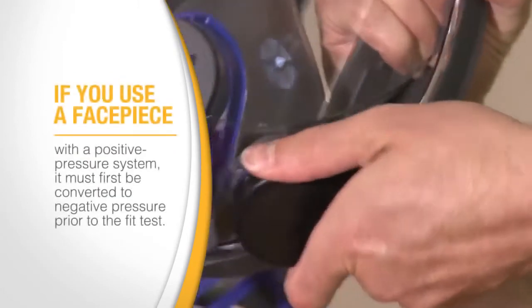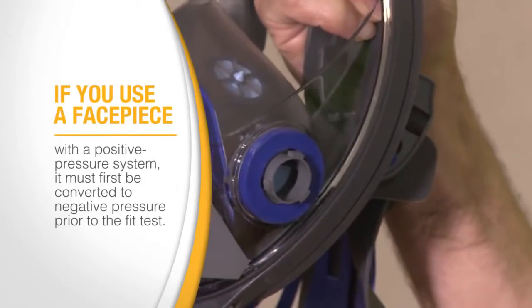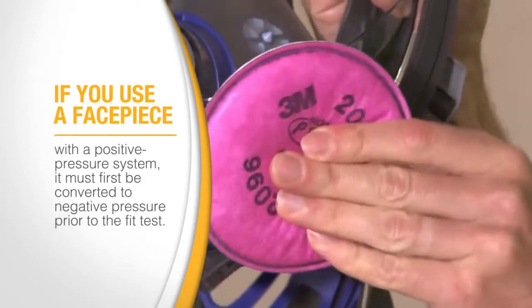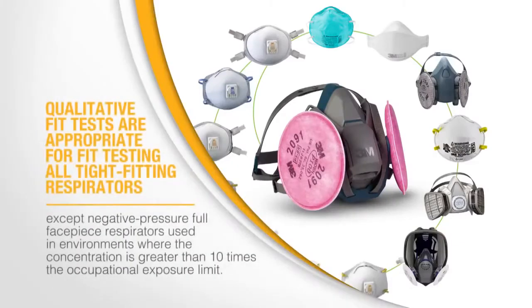If you use a face piece with a positive pressure system, it must first be converted to negative pressure prior to the fit test. Qualitative fit tests are appropriate for fit testing all tight-fitting respirators except negative pressure full face piece respirators used in environments where the concentration is greater than 10 times the occupational exposure limit.